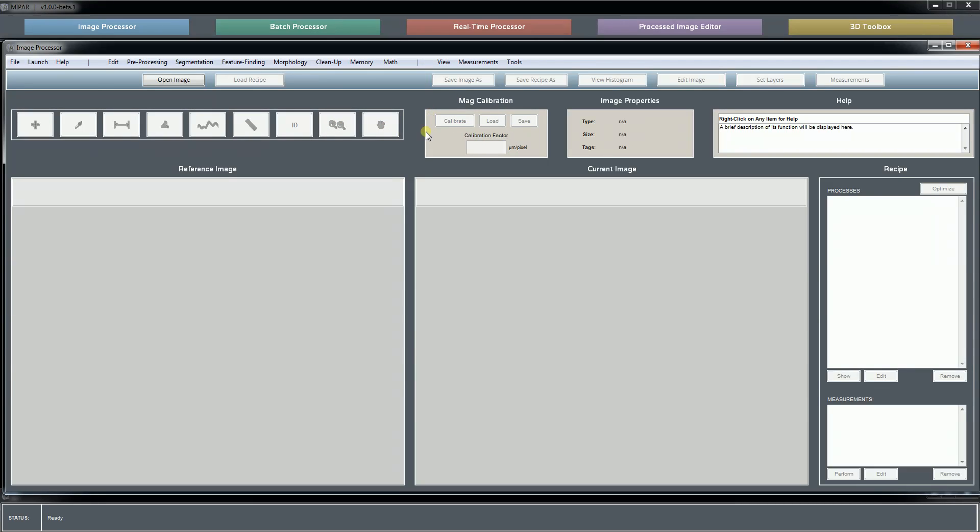This is the calibration panel that will allow you to set the scale of your image, the pixels per micron, also known as calibrating the magnification. MIPAR is exclusively in units of microns at the moment. It was developed as a microstructural analysis tool and it's been very convenient for us to always work in units of microns.